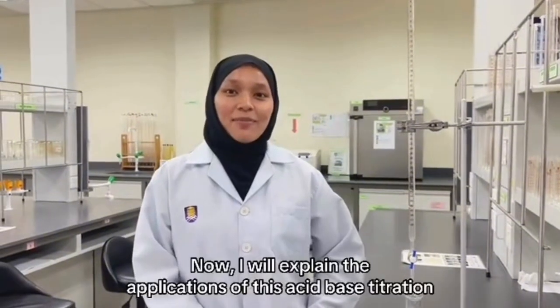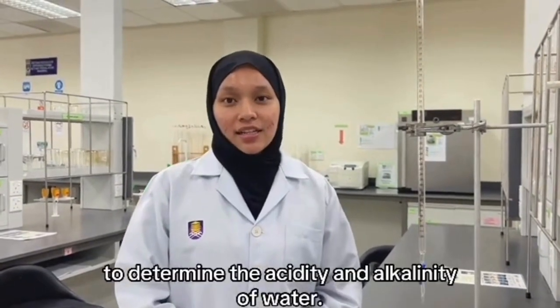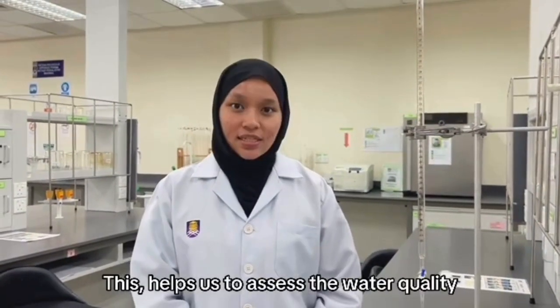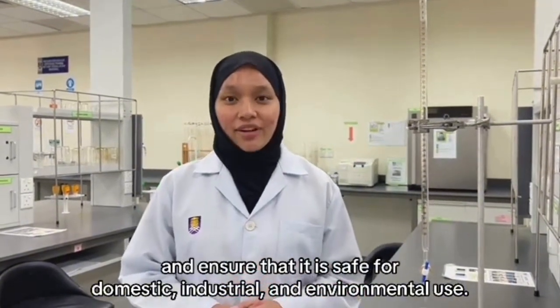Now, I will explain the applications of this acid-base titration. This acid-base titration is widely used in water analysis to determine the acidity and alkalinity of water. This helps us to assess the water quality and ensure that it is safe for domestic, industrial, and environmental use.